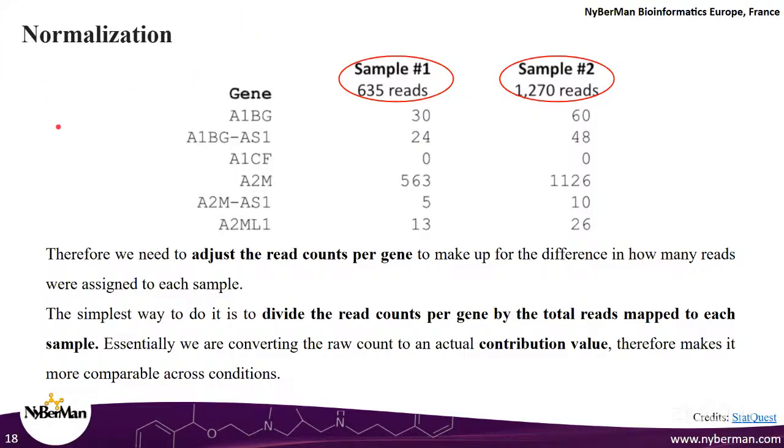But in a hypothetical scenario where the total number of reads is the same across all 6 samples, which will never happen, by the way, even then you need normalization. So why? Normalization, like you're saying, will cut down the value to a decimal range, 0 to 1, right? You are thinking in the right direction. Yes, it cuts down the value to a certain range.